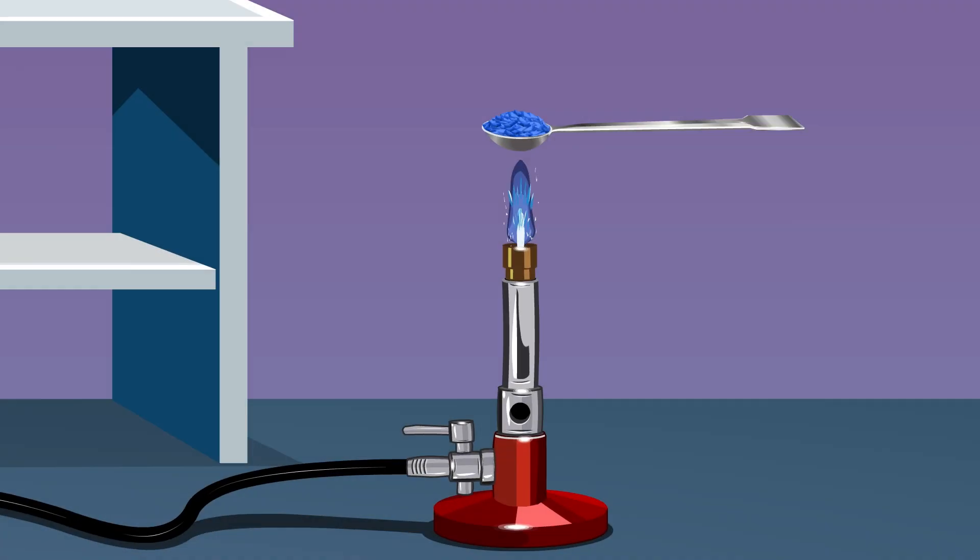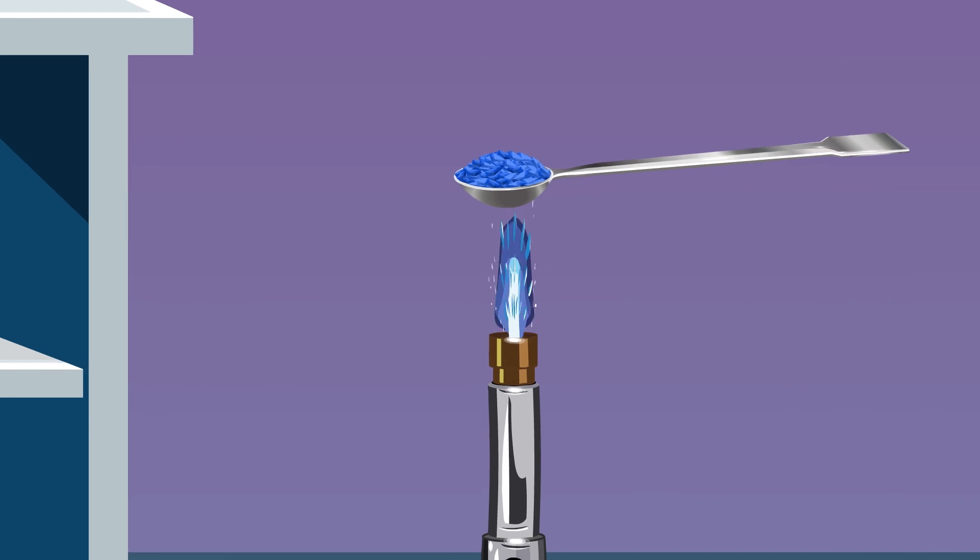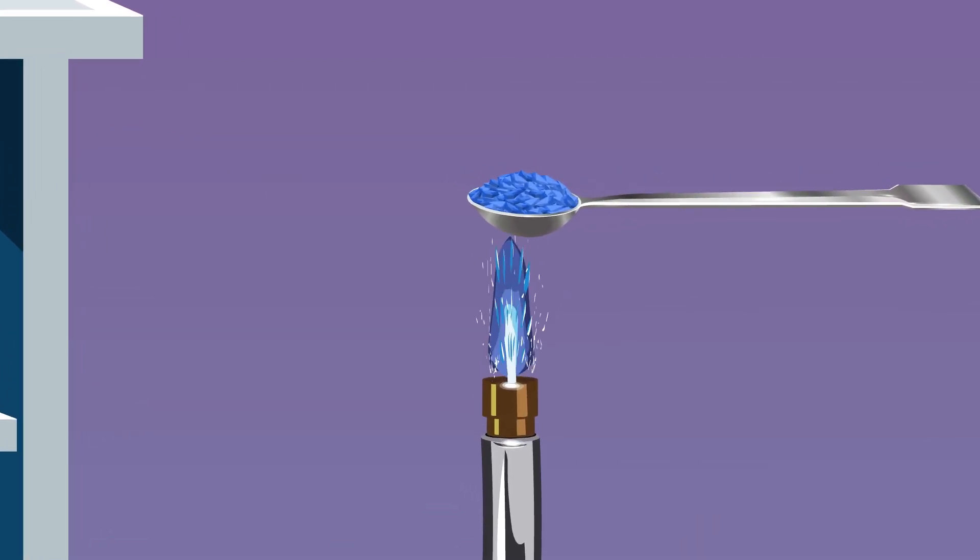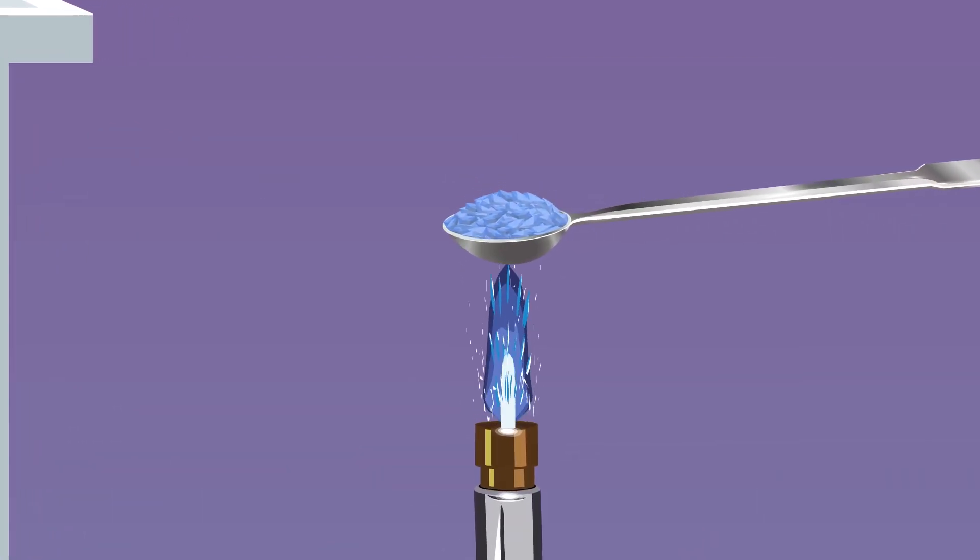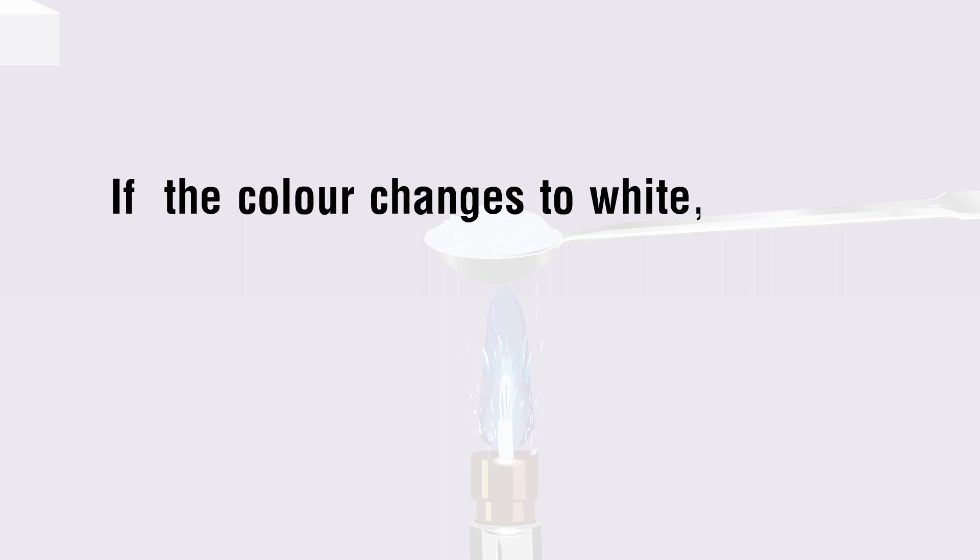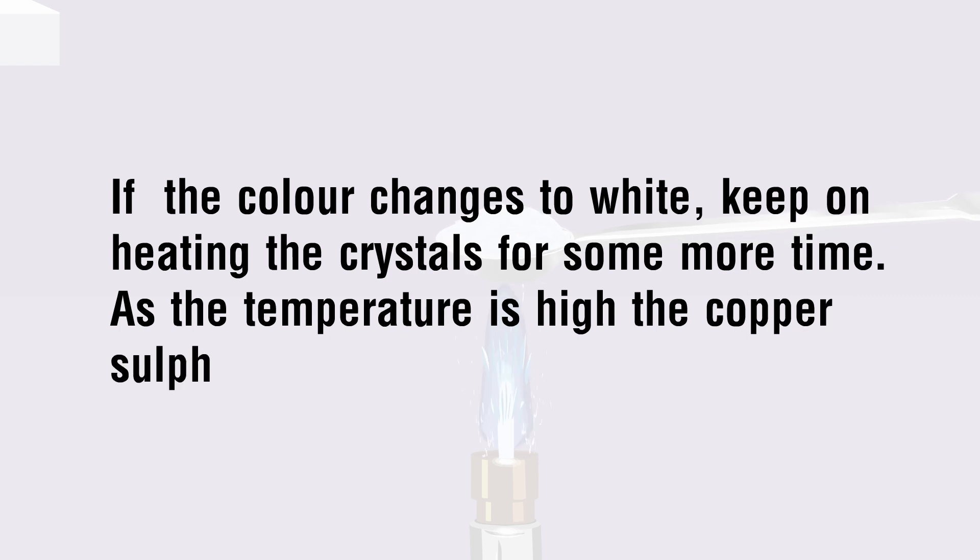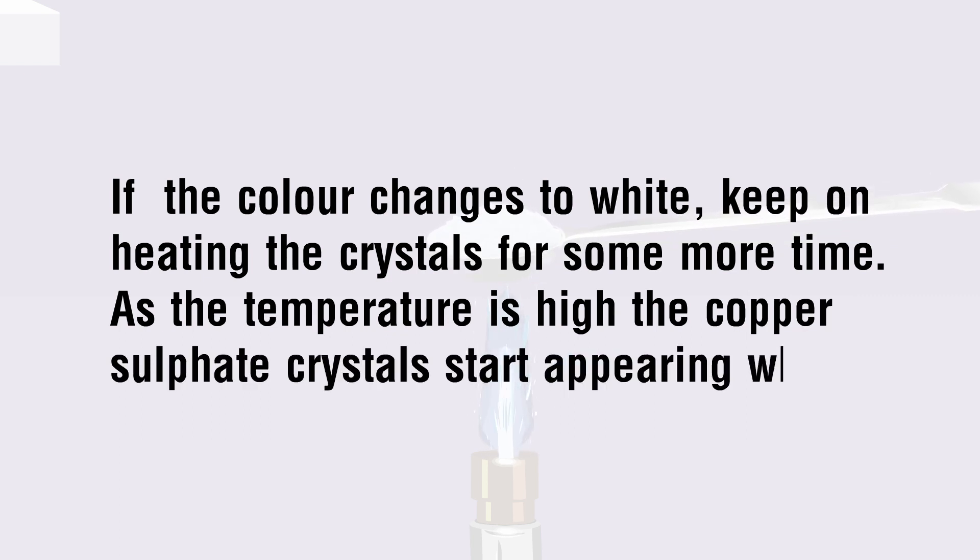Heat these crystals on a burner by keeping the spatula directly over the flame. Notice the change in color of the copper sulfate crystals—they change to white during heating. If the color changes to white, keep on heating the crystals for some more time. As the temperature is high, the copper sulfate crystals start appearing white.